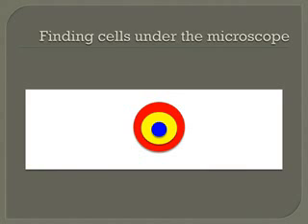The yellow, low power objective lens is more than twice as magnified as the scanning lens. As a result, any errors that you make get magnified. If you're slightly off center, you might not find anything in the field of view. In addition, you need to be a lot more precise when you are trying to get things in focus using the coarse adjustment.